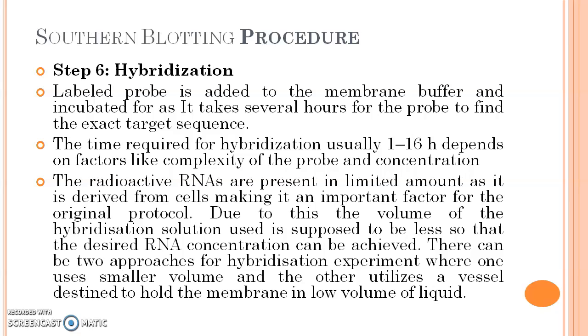Step 6. Hybridization. Labeled probe is added to the membrane buffer and incubated, as it takes several hours for the probe to find the exact target sequence. The time required for hybridization is usually 1 to 16 hours, depending on factors like complexity of the probe and concentration.